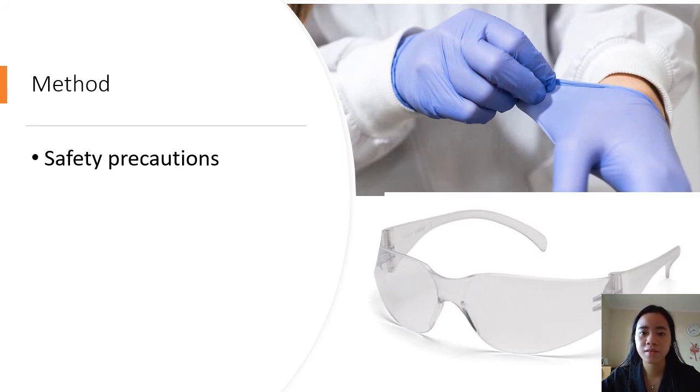Before conducting the experiment, we had to wear safety goggles and gloves. We knew that we had to hold the test tube and the lit match away from ourselves and carefully keep distance between flammables and flame. Additionally, we used small quantities of metal and low concentration of acid.